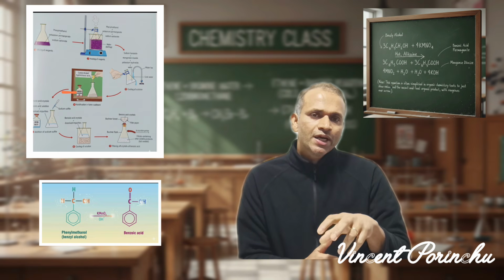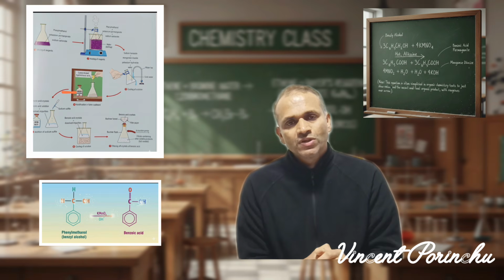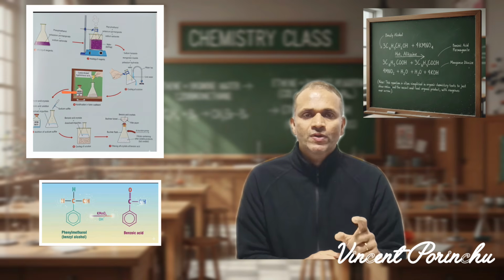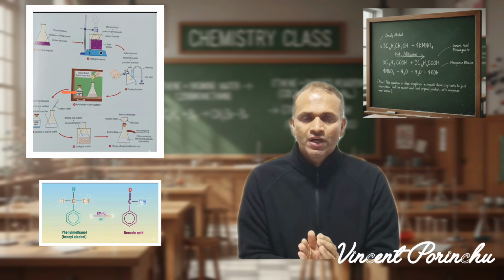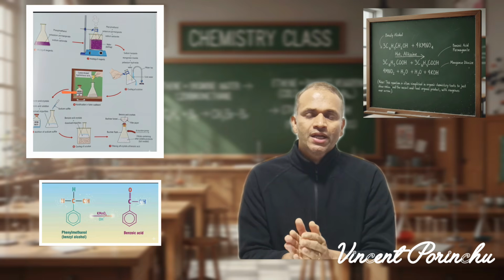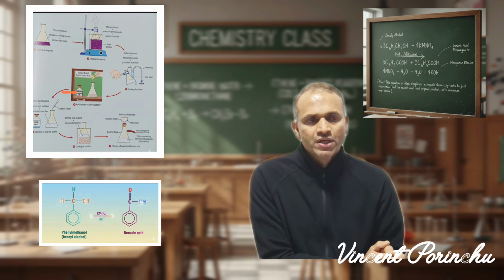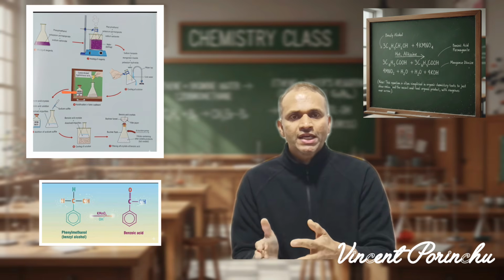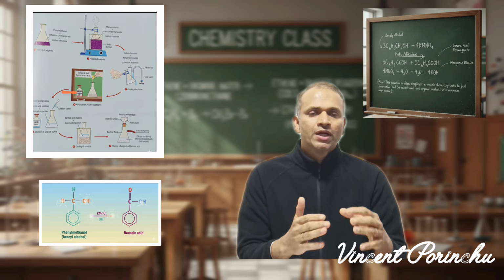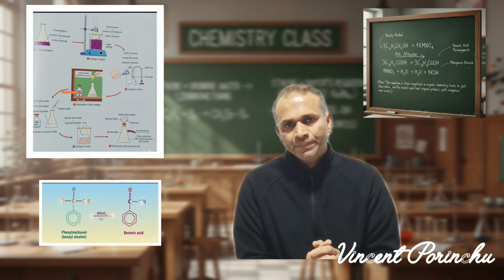So the brown color of the mixture will disappear after addition of sodium sulfite, because in manganese dioxide, manganese has oxidation number 4. After addition of sodium sulfite, the manganese dioxide is reduced into Mn dipositive soluble ions. So after addition of this reagent, the insoluble manganese dioxide brown precipitate becomes a soluble form.